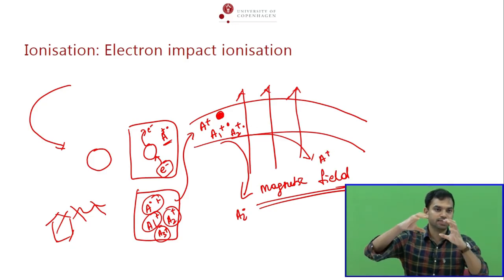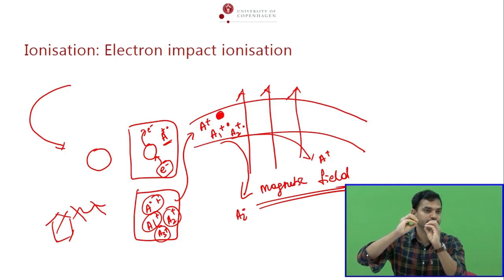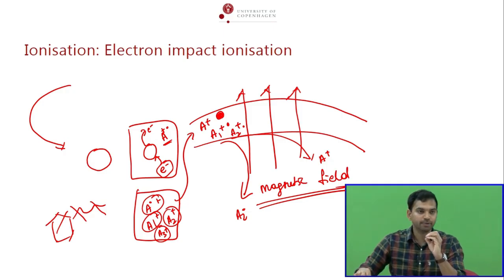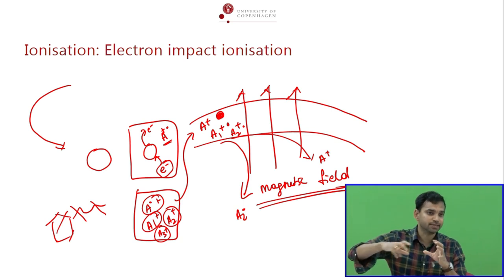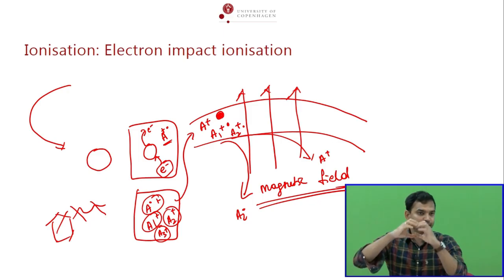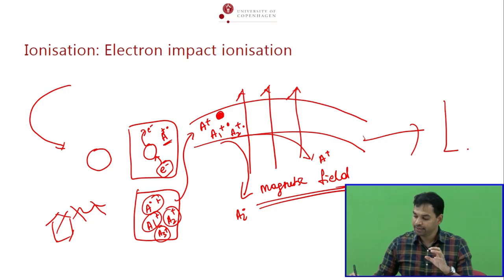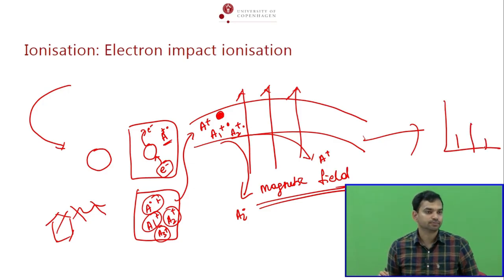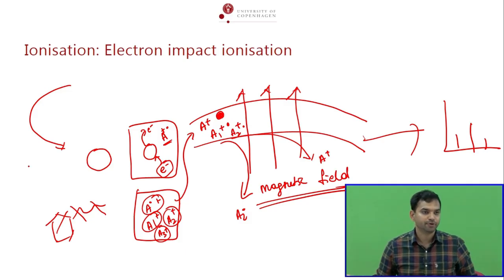Now, what we have is actually the spatial separation of the ions based on their mass and charge ratio. Okay, this is all happening in a fraction of a second. Basically, it's happening so fast, right? So they separate in the mass analyzer here, and then they will be detected as individual ions because they are separated here based on the mass by charge ratio. Is that clear? And this is the basic principle of mass spectrometry, the ionization and separation.